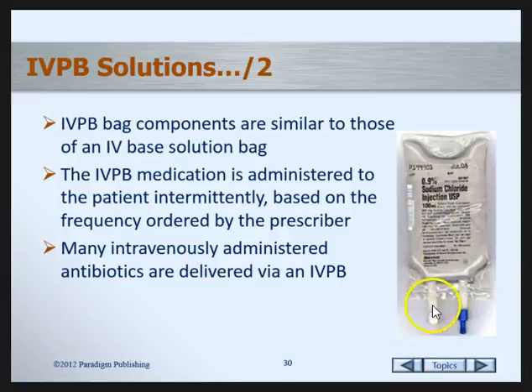You're going to have the volume that's contained in the bag, and you're going to have who the manufacturer is. The critical site on an IV bag is the injection port once it's cleaned with a sterile IPA swab, and the tubing port once this cap has been removed. Inside of these ports is a hard plastic diaphragm.